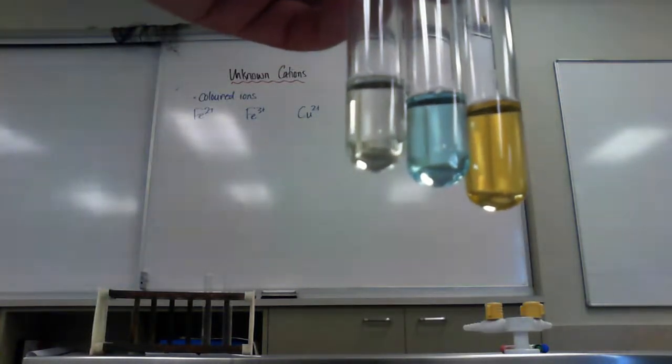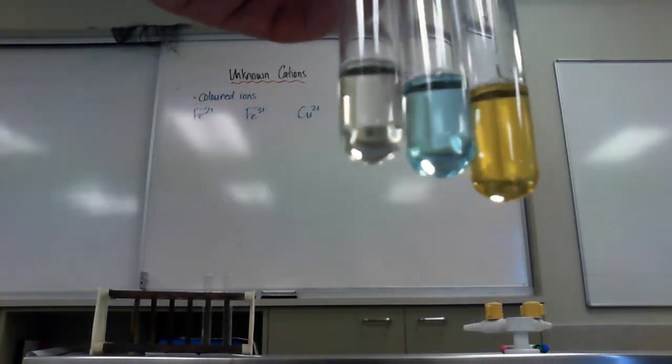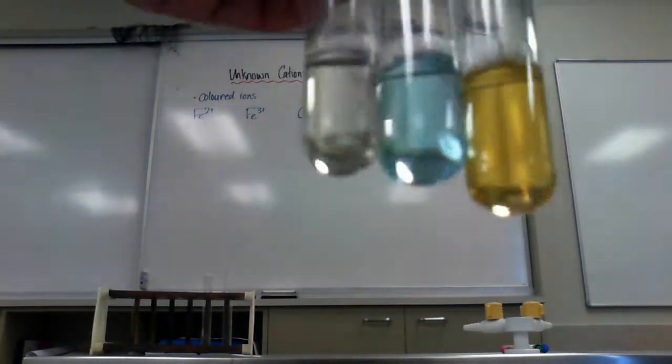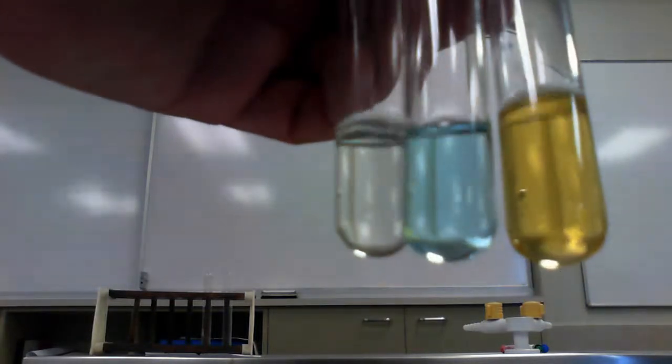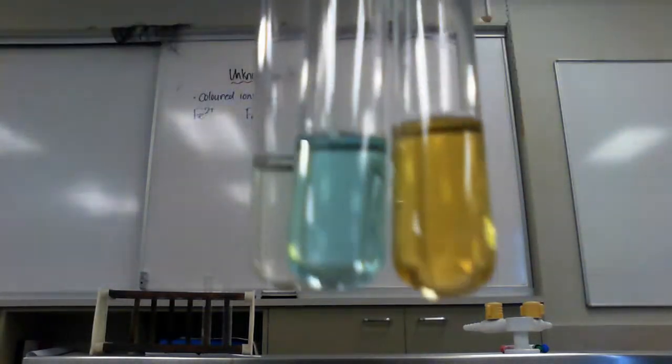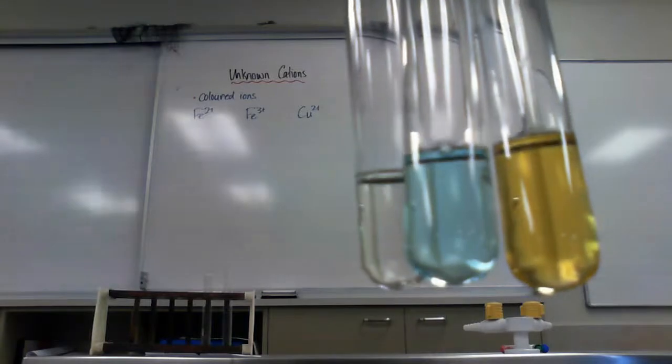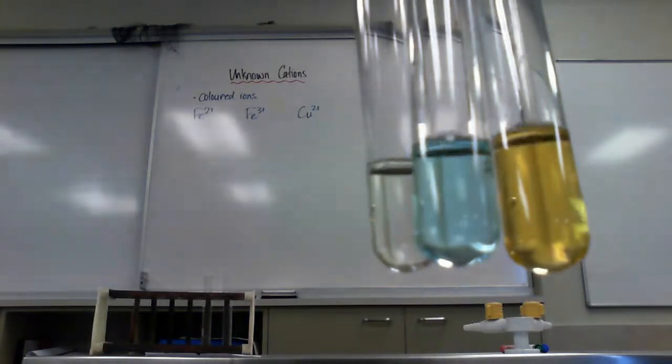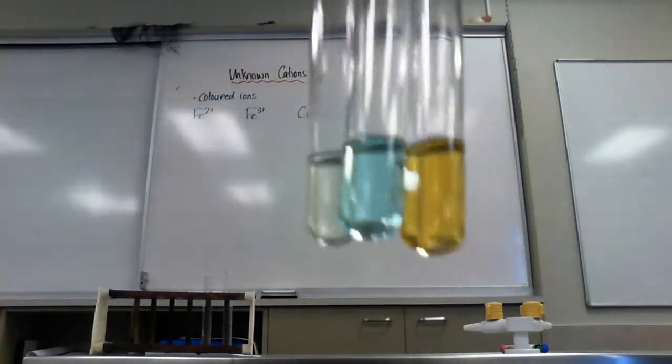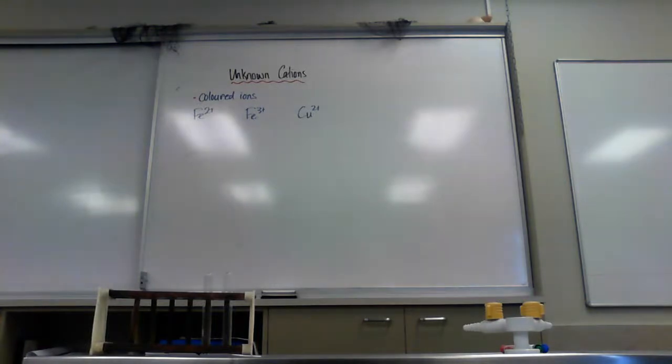On the far left is Fe2+, which, it may be hard to see, is a very very pale green. Then I've got Copper 2+, which is a blue color, and then that orangey yellowy sort of color of Iron 3+. However, we still do need to confirm that they are what we think they are because some anions have colors as well.